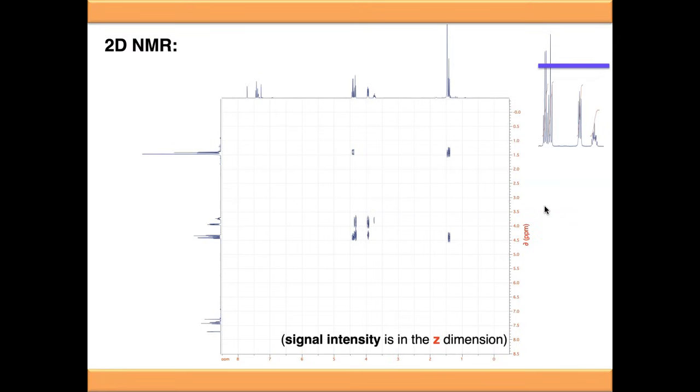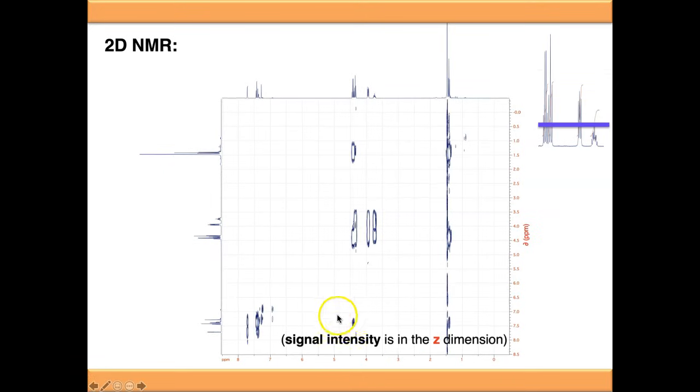So what we need to do is take a high Z slice to interpret the strongest signals. So you can see the strongest signals here appear, but the weaker signals are invisible. They haven't appeared yet. So the stronger signals look nice and interpretable here. We can see nice clean signals. So that's fine for interpreting the strong signals. And then we need to roll down to be able to see the weaker signals like this. But we can't just take a single image, because now that we can see the weaker signals, great, our strong signals have become very noisy and quite difficult to interpret.